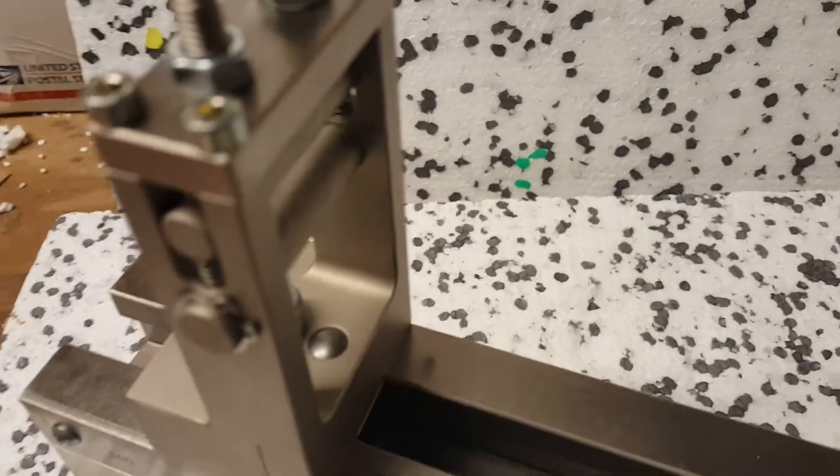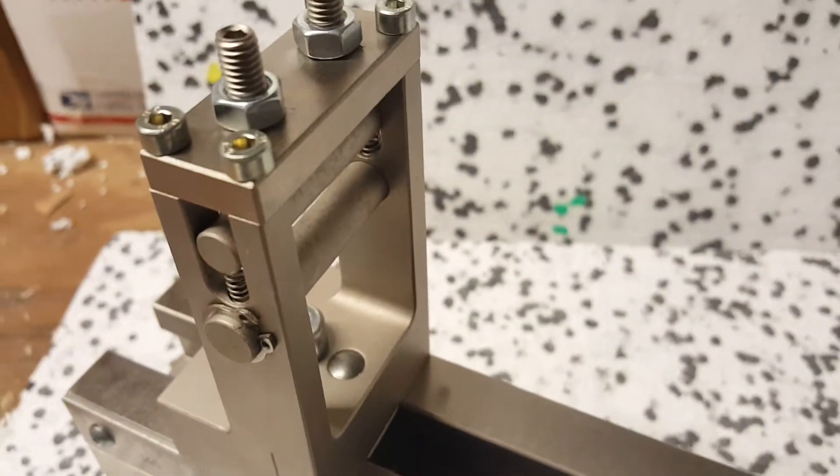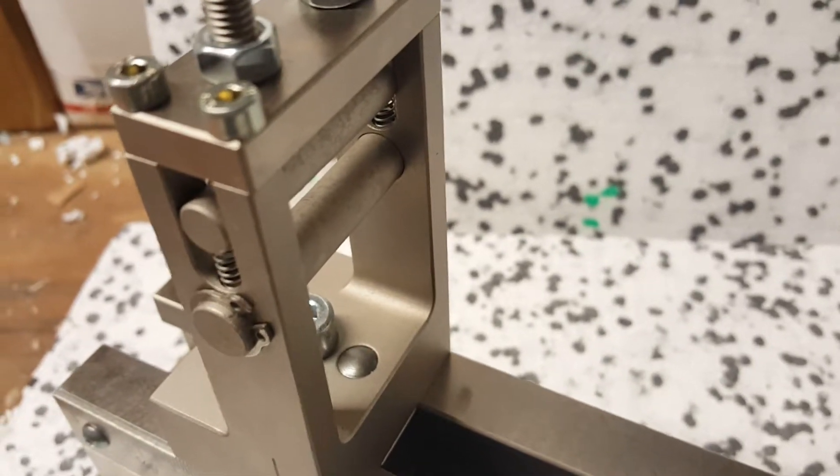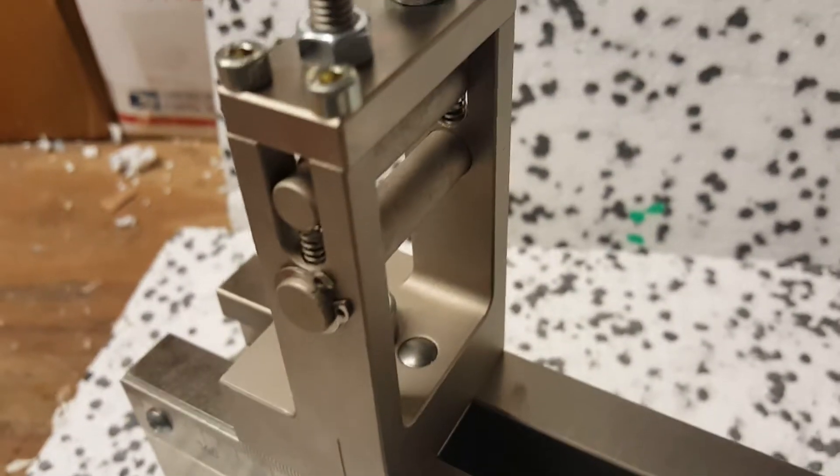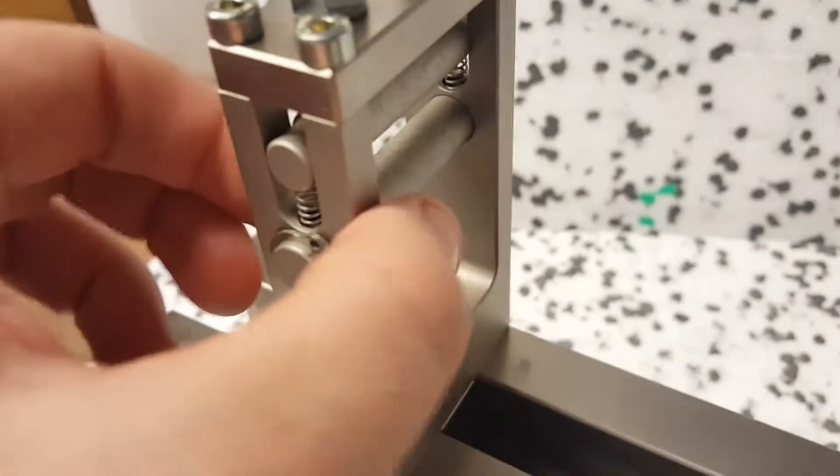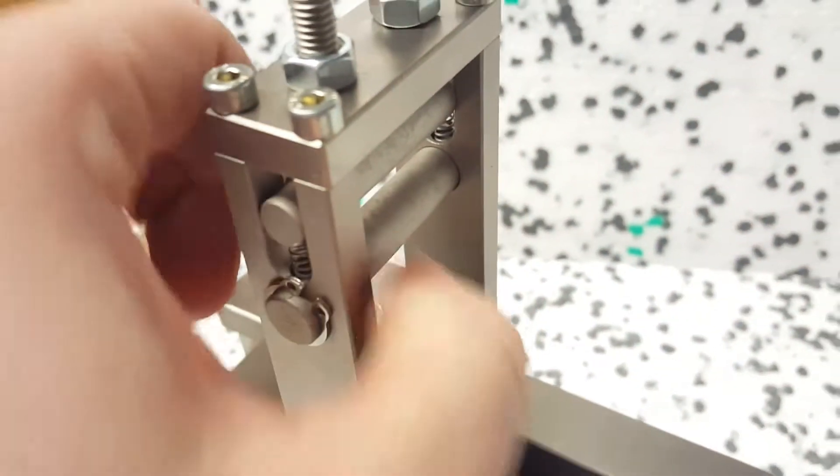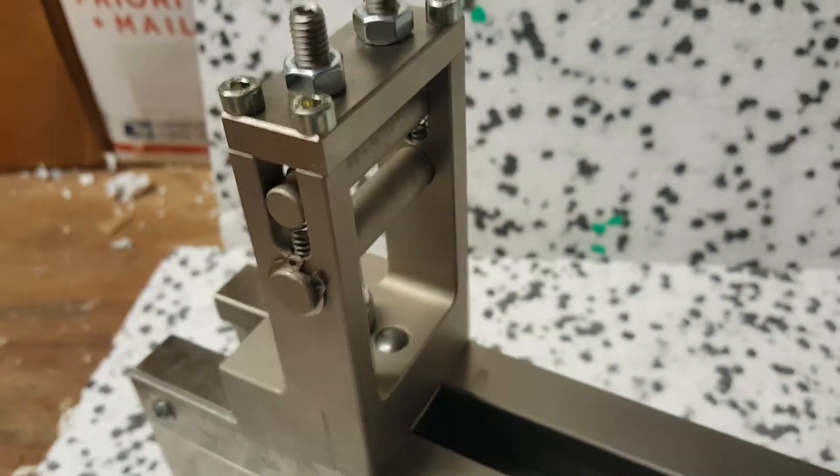You see on the supports that there are specific radius. These ones are 10 millimeter in diameter, 5 millimeter radius.